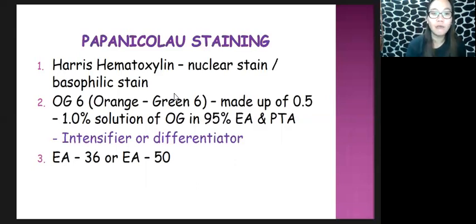These are the different stains incorporated in Papanicolaou staining. In order for us to understand the procedure in your module, let us try to understand the different steps, or the schedule of activities, for Papanicolaou staining.